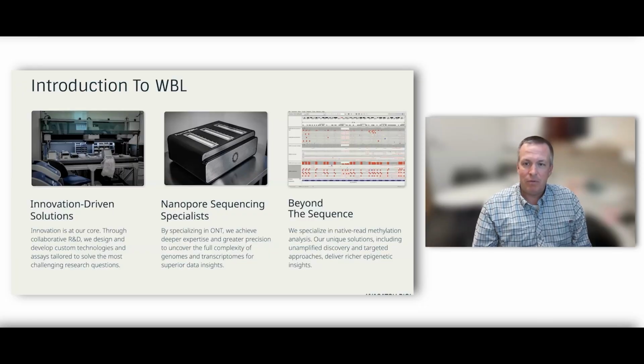We wanted to be able to sequence whatever we had available to us without conversion, either by bisulfite conversion, as was mentioned before, or even enzymatic conversion, and certainly without amplification. We want to see what is natively available in the DNA, as that helps us to more accurately point to what issues may be happening in the DNA without technical bias, which should eventually give us the best quality data and thus the best quality predictors in the future as we move forward.